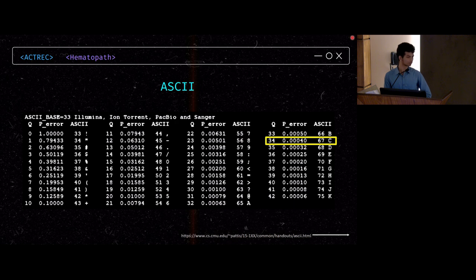Based on the intensity, it will judge every cluster: whether this cluster's intensity met the threshold or not, whether it was less or not. If less, there is a statistical probability that this is good or bad. So it makes an estimate and gives a score, because we are taking many decisions based on that.